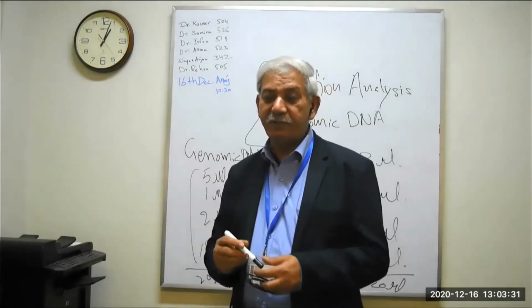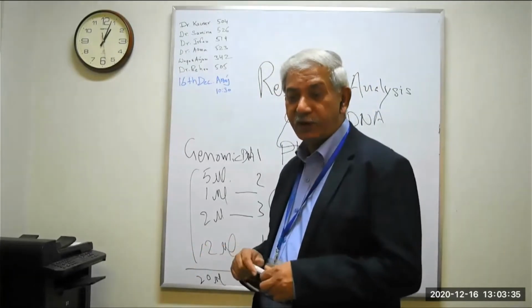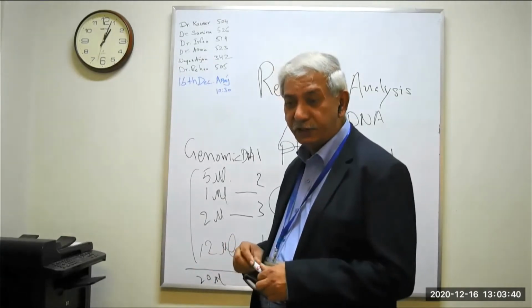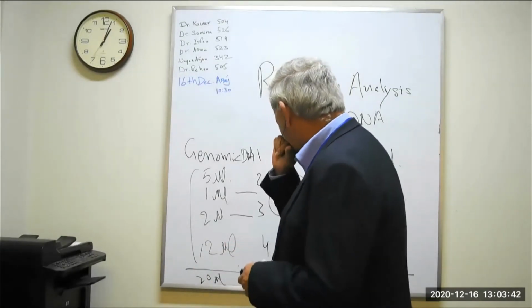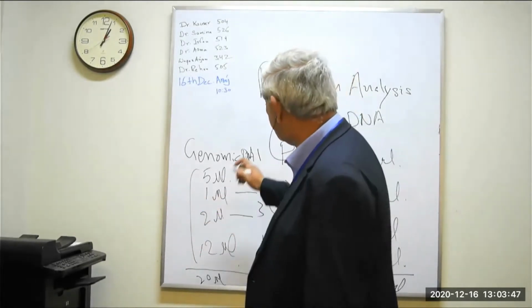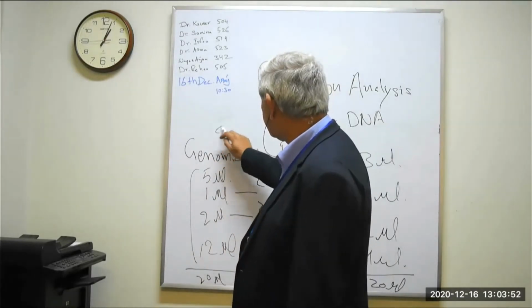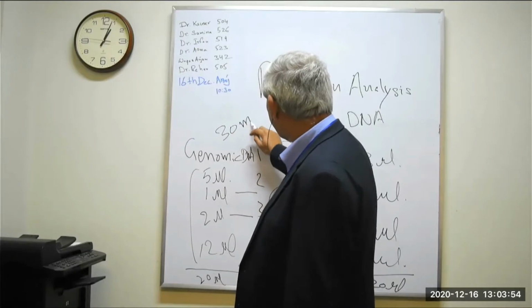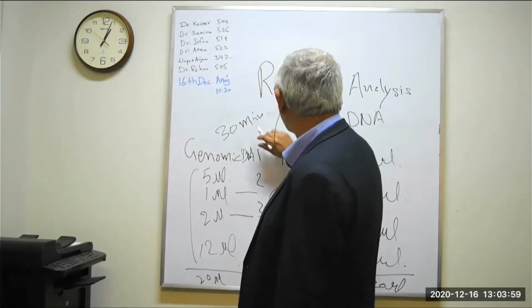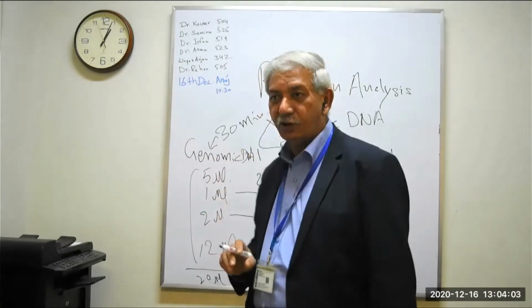This reaction will be incubated. It can be incubated overnight. It can be incubated for about an hour. But we will do a partial digestion of the genomic DNA for about 30 minutes. And same thing for the plasmid DNA. 30-minute digestion of plasmid, 30-minute digestion of genomic DNA.